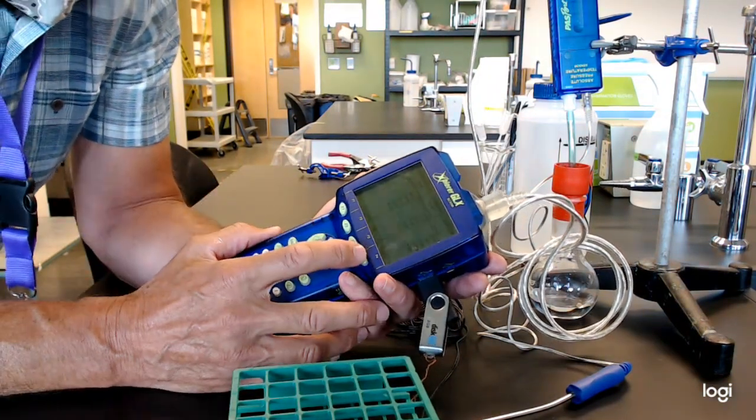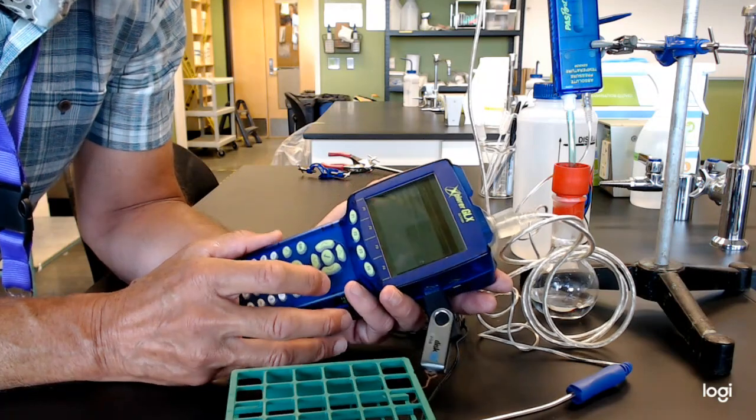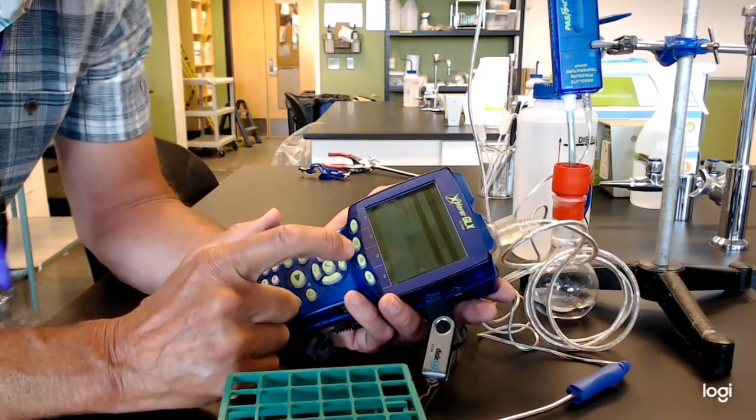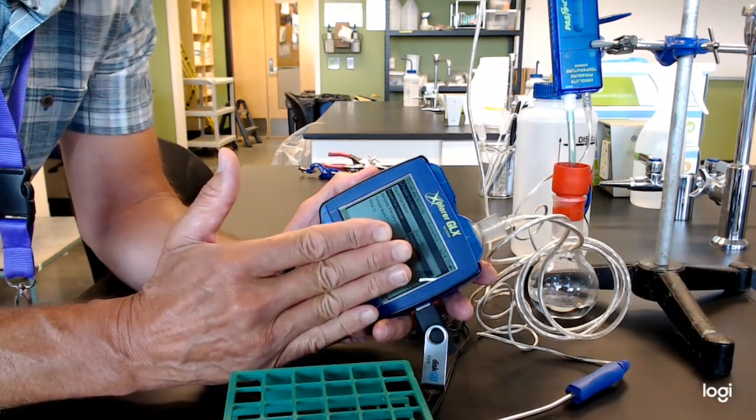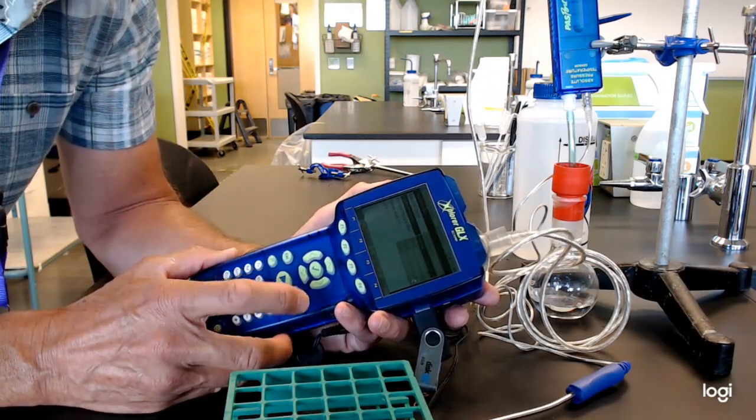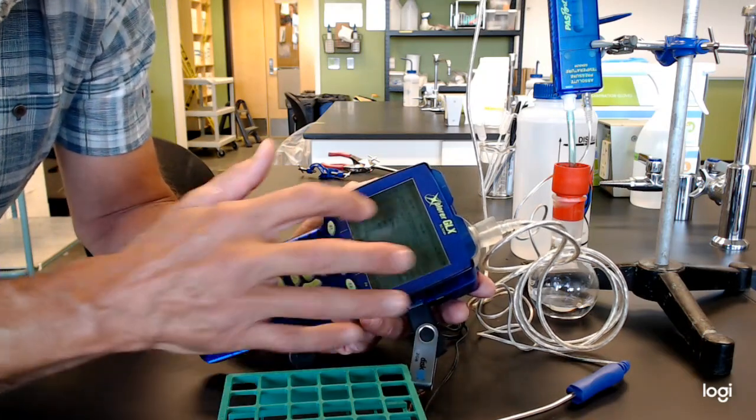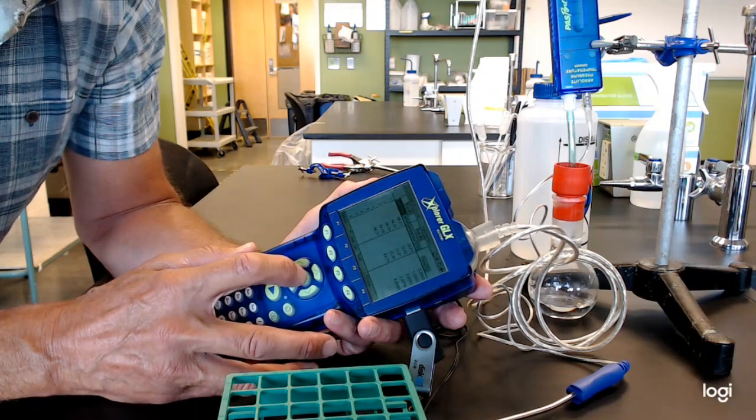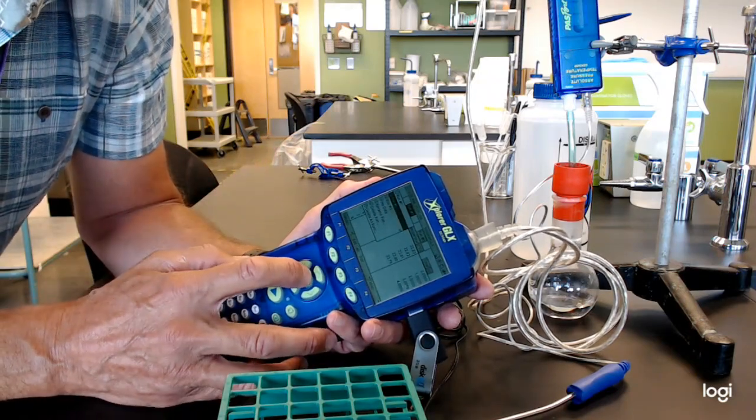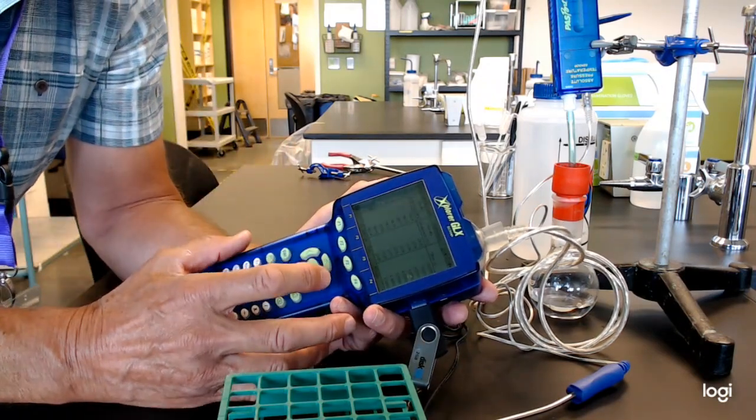So now I want to just go look what that looks like when it's time to export. Tables. Export all data. So right now, I don't have any choices on this screen that say, oh, I want run one, or I want run two, or I want run three, right? So the assumption is whatever screen you saw last is the one you're going to get. So I don't want that. I want run two. So I say cancel. I'm going to go back here and look at this. That says run three. So I highlight, arrow up, pull that down, and now I have the options to pick the run I want to export. I'm going to export run two now. And all of the screens changed over to run two. And now when I go back into export, I'm actually exporting run two.